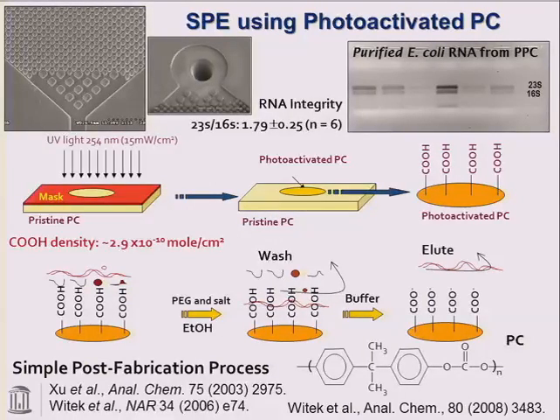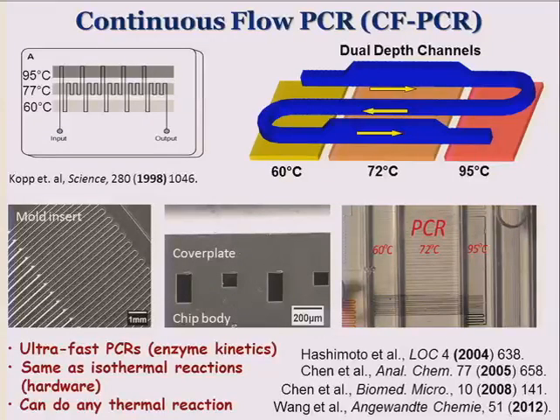The other thing that we've done in order to increase the bed capacity, we use this molding step to not only make these fluidic networks, but also these pillars. So actually the load of this is pretty much predicated on the size and the spacing of these pillars. And we have great flexibility in how we can choose that. And then Claudia showed you this too.